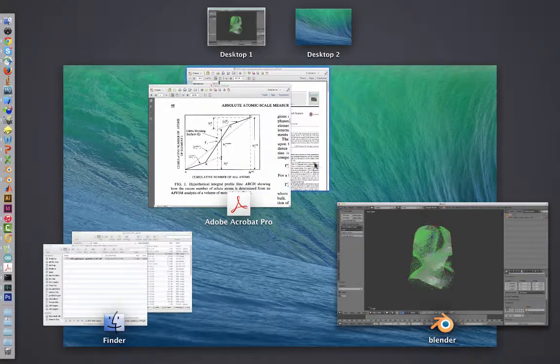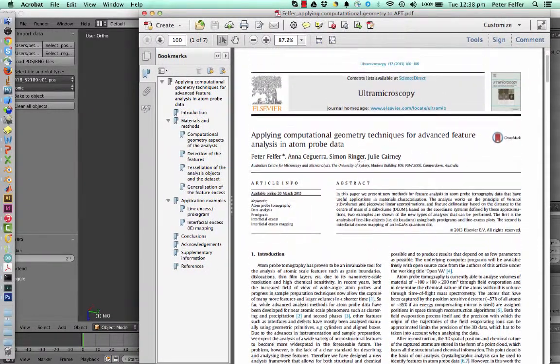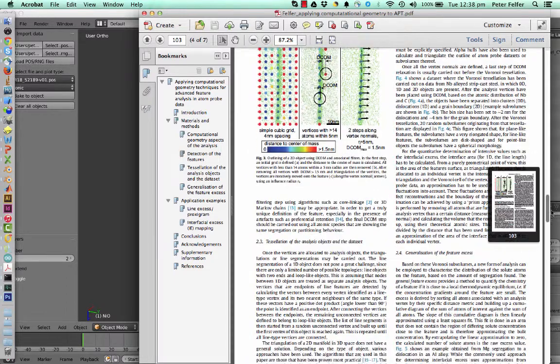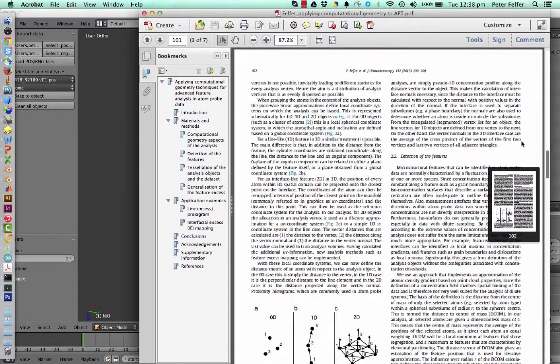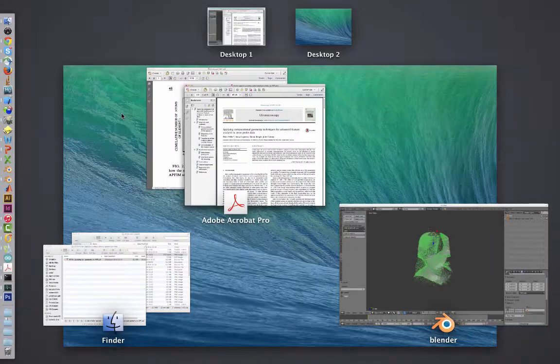that surface. In order to do that, you can have a read through my paper that I wrote about 2 years ago, and it came out last year, and it goes through how to do all of these things for interfacial excess calculations and also mapping, which is a topic of a later tutorial, for 0, 1, 2 dimensional objects in 3D atom probe data. And that's really the basis of that tutorial. Anyway, if you're interested in that, I'll throw the information about the relevant papers up on the web. And you can, of course, contact me if you've got more questions.